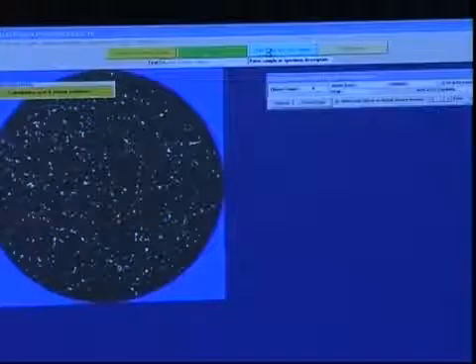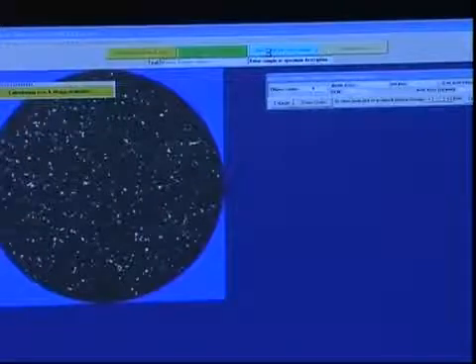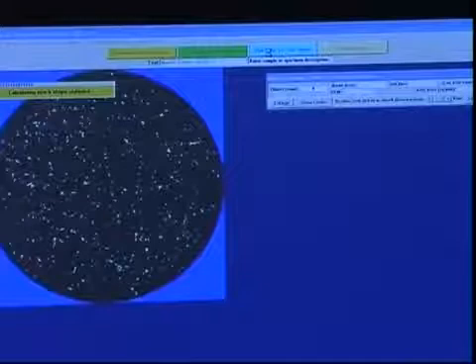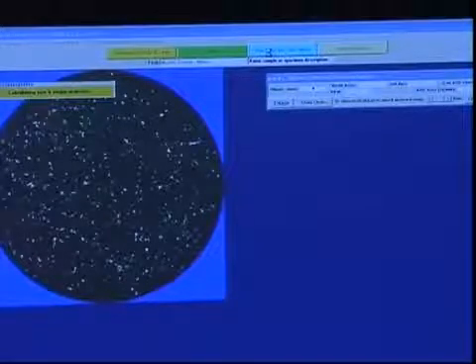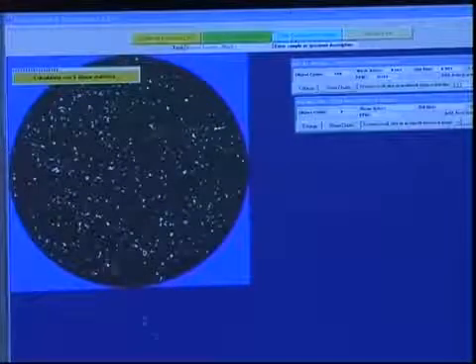Now it's going through all 3 tests automatically. And the results are dumped into an Excel spreadsheet on every test. In this particular case, when I'm measuring the image using the automatic controls, it will be transferred into Excel. And I think I can show you that.